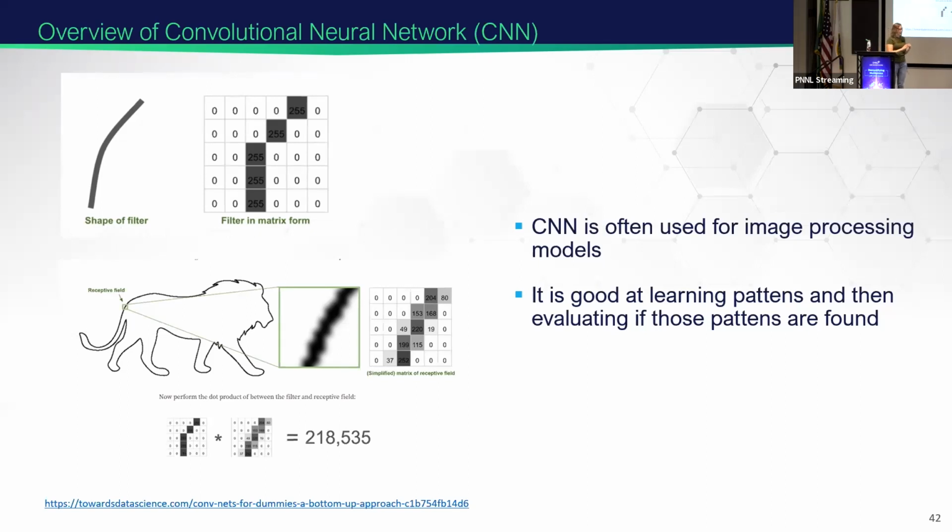And so using that, with the higher values meaning, yes, we're finding the patterns, the machine learning model continues on and does a lot more complicated layers that I'm not going to get into. But that's, high level, we're looking for patterns. We're training the machine learning model to look for these patterns for us, specifically looking for healthy cells, infected cells. And this is a part where, again, this was decided not after data was collected, but before, with Enoch Young, the machine learning expert that was part of this project.